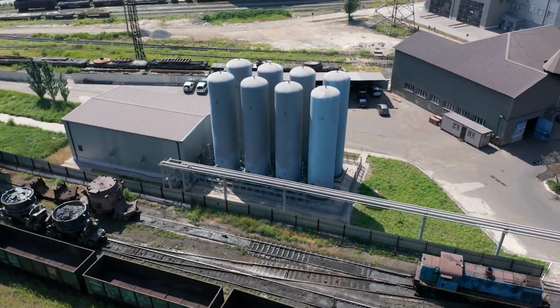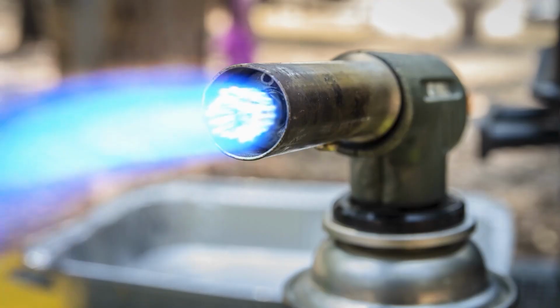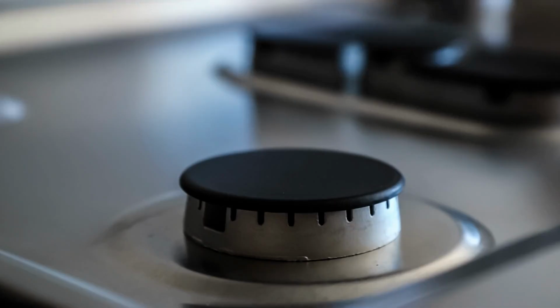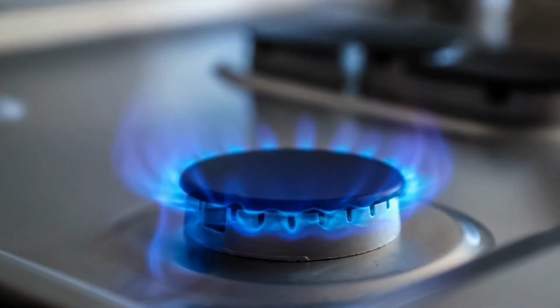Flammable gases include hydrogen and should be stored in well-ventilated areas away from open flames, sparks, or other equipment that could give off excessive heat or even ignite. Flammable gases are those susceptible to fire or explosion when in contact with even the smallest heat source, like static electricity.